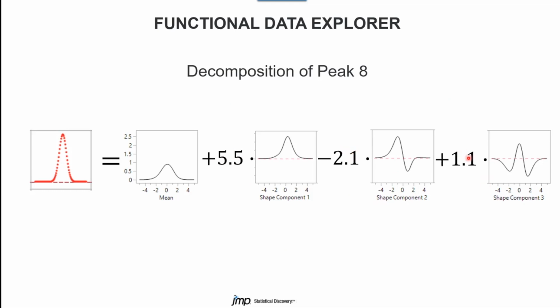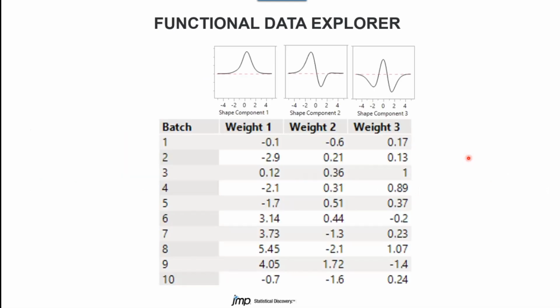That way we're able to tie everything up into a bow where we have a profiler that's predicting the shape of the response given the actual DOE factors as inputs. And I find this to be a lot easier to interpret than the functional principal components profiler.